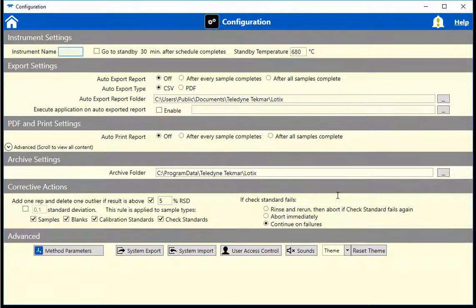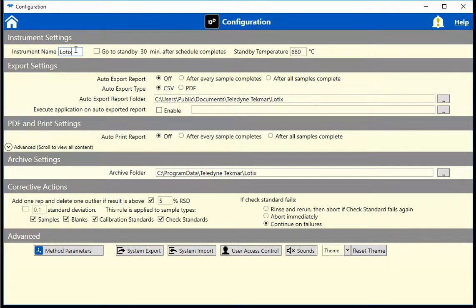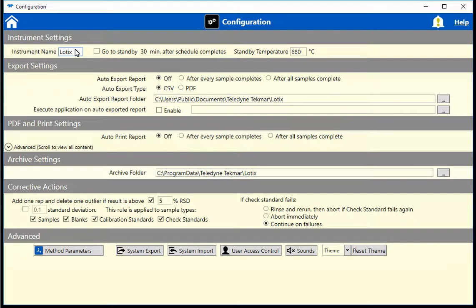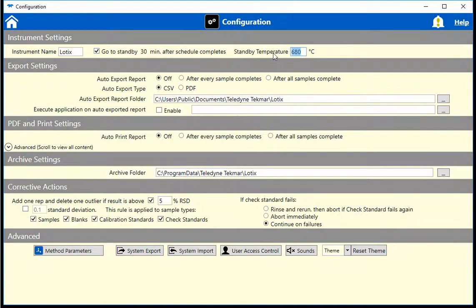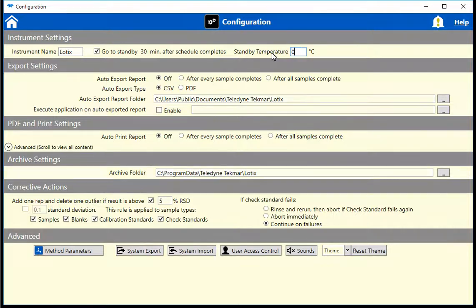The instrument name can be entered under the Instrument Settings section. You can also choose to have the instrument go into a standby mode 30 minutes after the schedule has completed, at which time the temperature of the furnace will change to the temperature set here. If you would like the furnace to turn off to save energy, set the temperature box to 0 degrees C. The carrier gas will automatically be turned off if the box is checked.